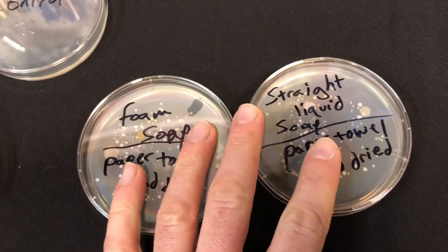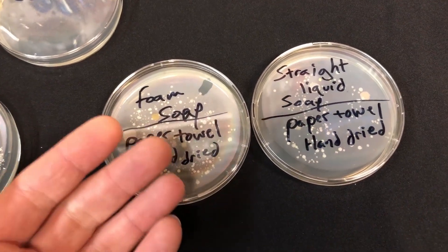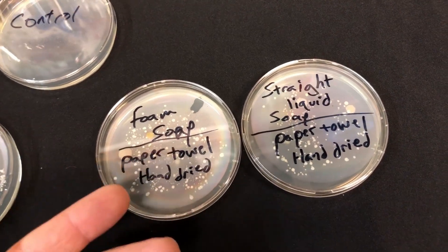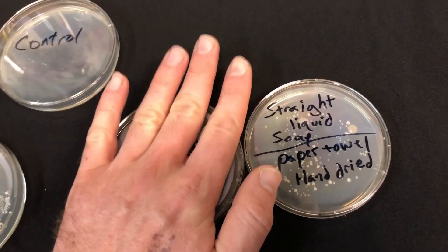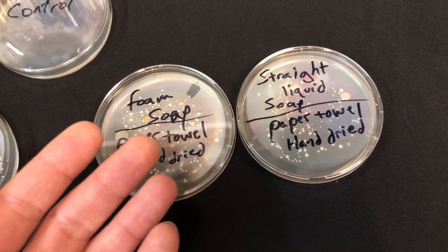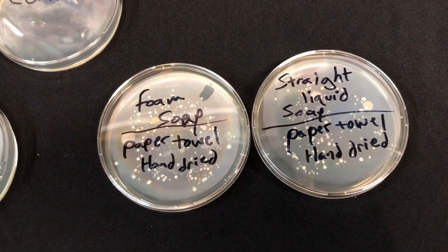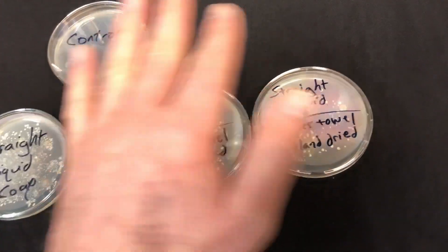The reason why the paper-towel-dried set has less on it is because water acts as a conduit for transferring things. Think about it like this: if you drop a wet apple face-down on the floor, you're probably not going to pick it up and eat it. But if you drop something dry — like a flake of cereal — a lot of people probably would eat it as long as the floor was relatively clean. That's what you're seeing here: when the hands were more dry, there was less transfer of bacteria to the plate.